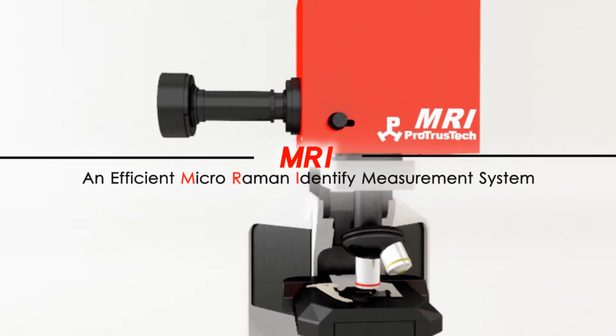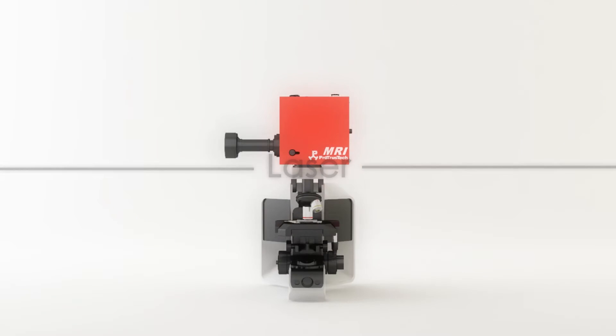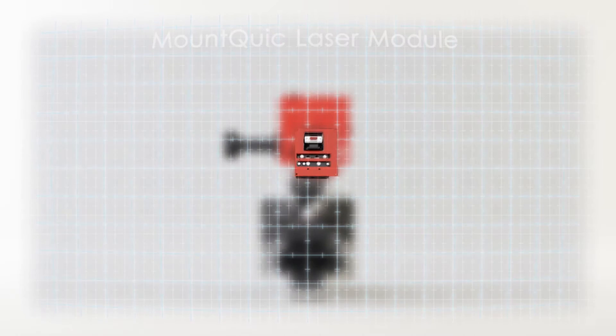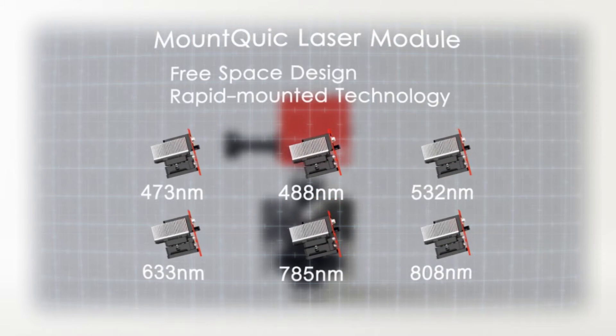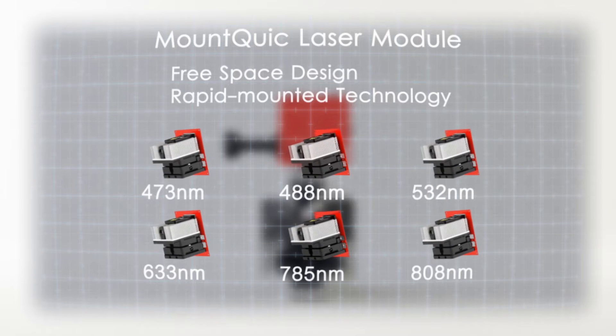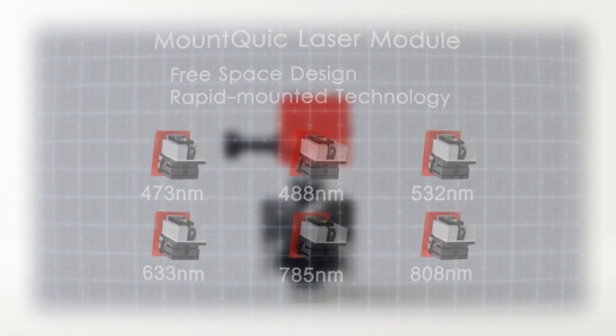MRI is an efficient micro-Raman measurement system developed by ProTrust Tech. ProTrust Tech's exclusively patented MountQuick technology allows quick alternation between laser modules and is built with specially designed free-space laser, which enables light application rate up to 100%.